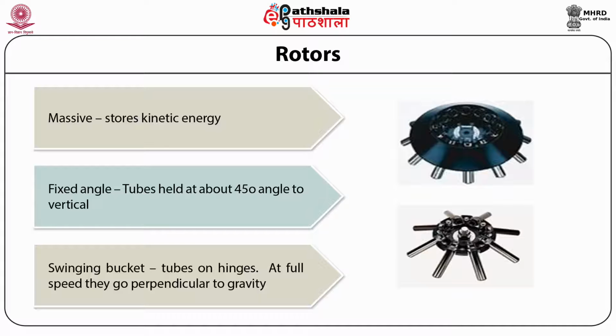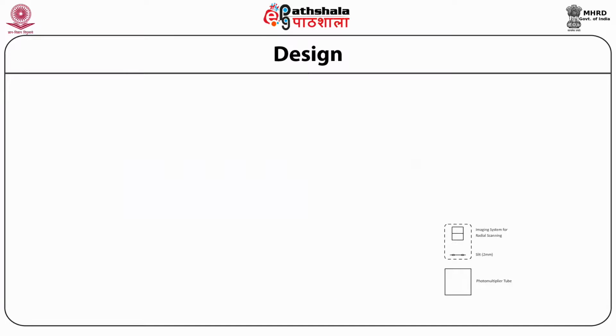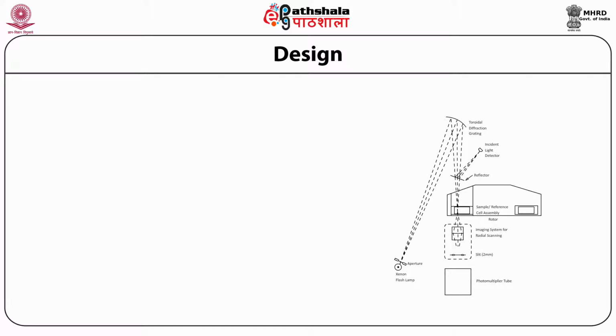There is another rotor known as the zonal rotor, designed for holding a sample of greater volume instead of multiple sample tubes. A self-locking mechanism is yet another important feature for some rotors, making rotor installation trouble-free and working safer. So these are a few important points that should be known about the rotors of the ultracentrifuge. Now we will discuss the design of this ultracentrifuge.